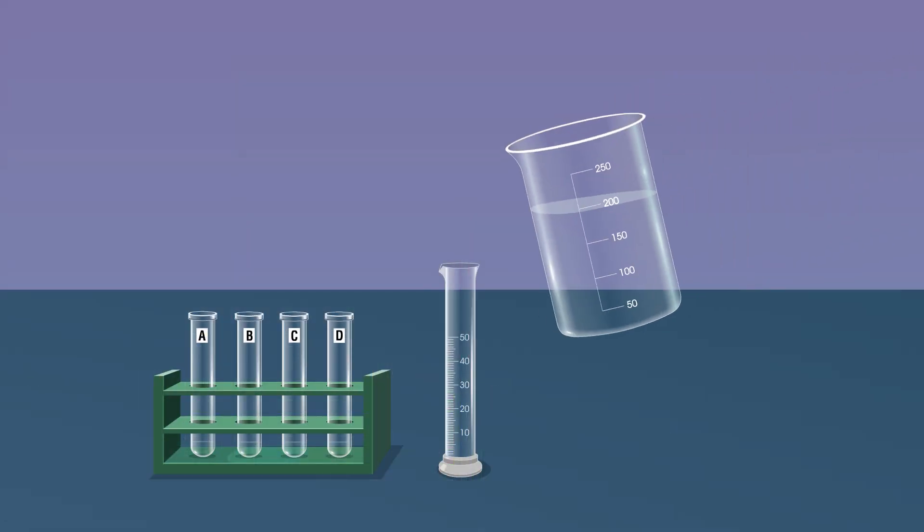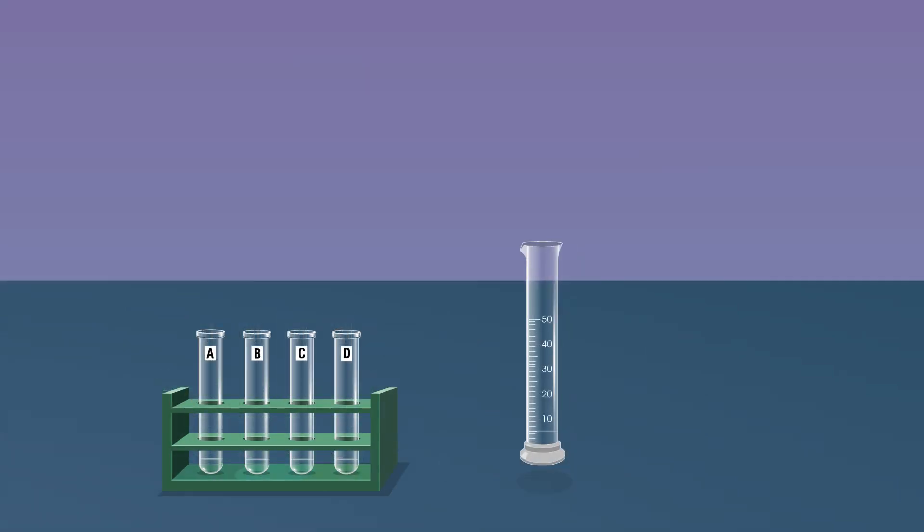Add 5 ml of distilled water from the 250 ml beaker to each test tube using a measuring cylinder.